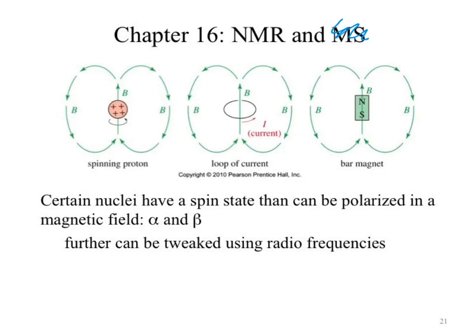It changes the ratio. In an individual sample, the only one that NMR can detect is carbon-13. In an individual sample, how much carbon-13 is there? Virtually nothing. So if we look at the two spectra, HNMR is run usually very quickly. You can usually get a complete spectrum in under a couple minutes. Carbon NMR, you usually need a couple hours because you have to build enough signal to noise to actually get a reasonable result out of it.